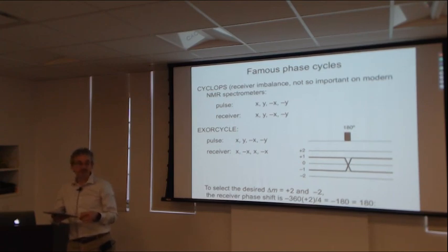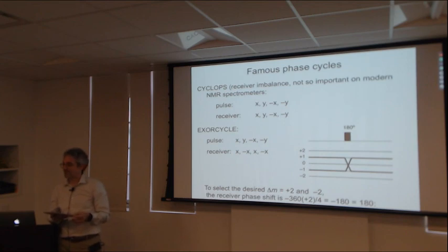But still, if you look at the most critical 180-degree pulses in the pulse sequence, you still might find an exorcycle phase cycle, even if there is a gradient nearby, just to make sure that the 180-degree pulse performs absolutely as well as possible.